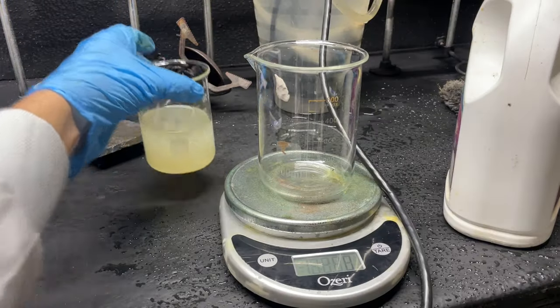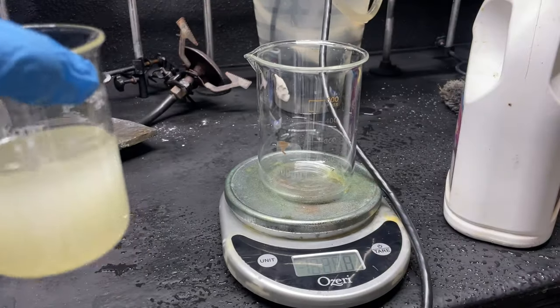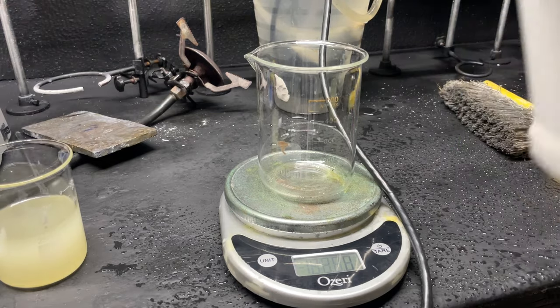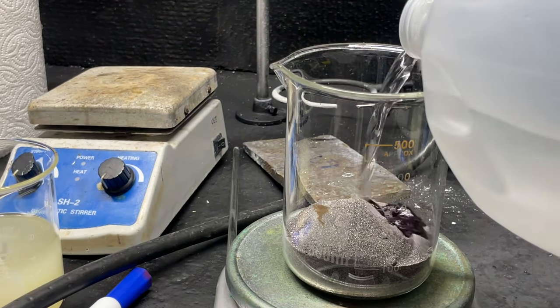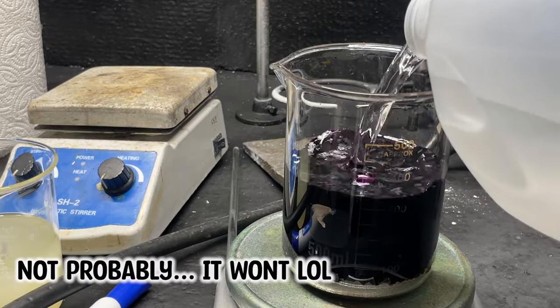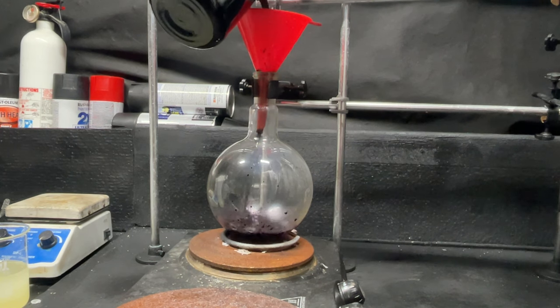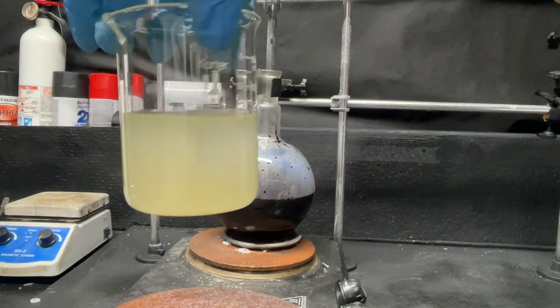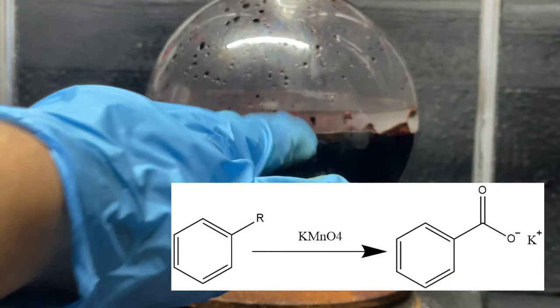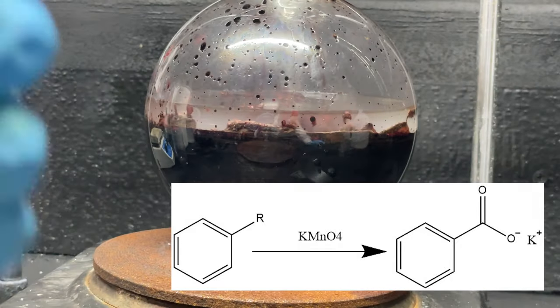Now we must oxidize our aromatic juice into benzoic acid. Based on our weight of this, assuming this is styrene — which is what I based my molar calculations on, since for the most part this is mostly styrene — we're going to need 206 grams of potassium permanganate. At room temperature potassium permanganate is not very soluble, so it's probably not going to fully dissolve, but that is fine. I'm going to pour it into a 1,000 milliliter round bottom flask and add all of our aromatic juice. The solution is already starting to turn a little brown at the layer with the organic, because potassium permanganate is oxidizing our organic layer and is turning into manganese dioxide.